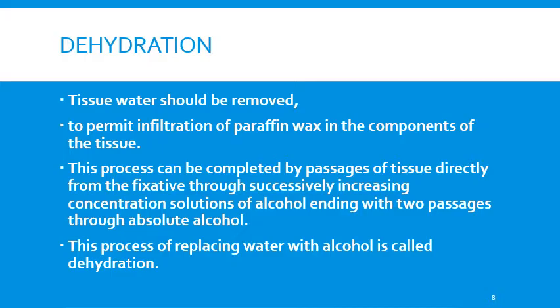Why? Why does the tissue pass through successively increasing concentrations of alcohol? To prevent damage, that means shrinkage or swelling of the tissue.